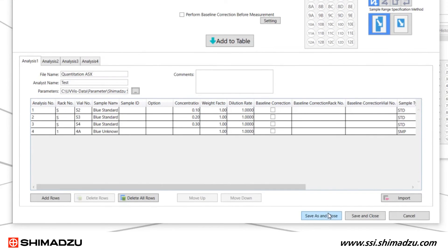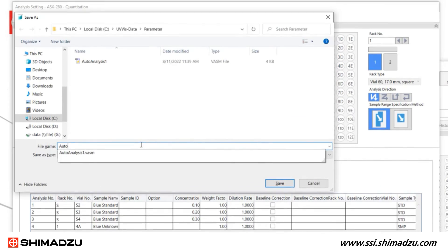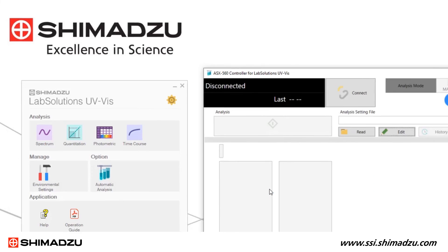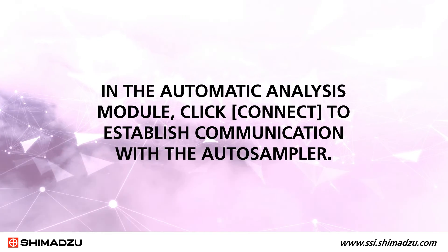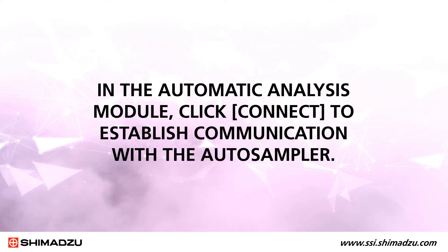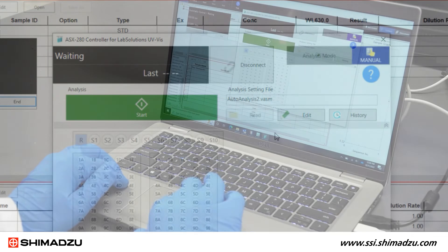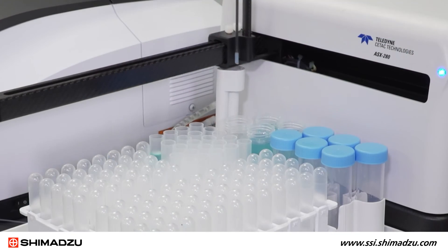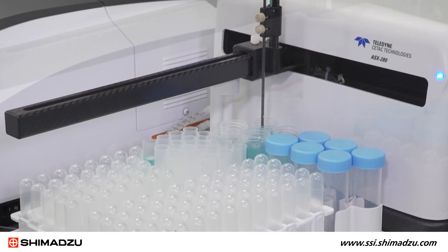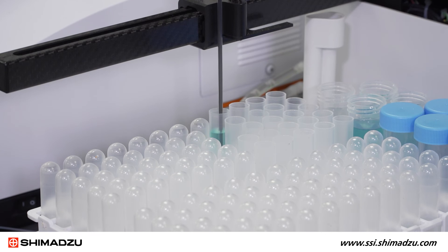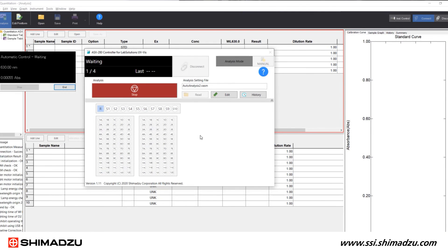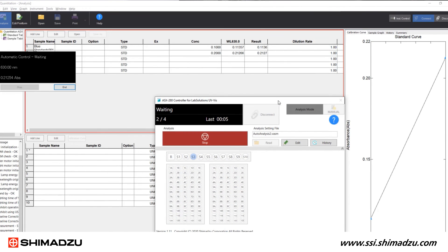Click Save As and Close to save the parameter file. In the Automatic Analysis module, click Connect to establish communication with the auto-sampler. The Start button will turn green if the connection is successful. Click the Start button. The spectrophotometer and the auto-sampler will carry out quantitation measurement according to the settings. In the Quantitation module, measurement results will show up in the Standard table and the Unknown Sample Table, and a calibration curve will be displayed on the right.